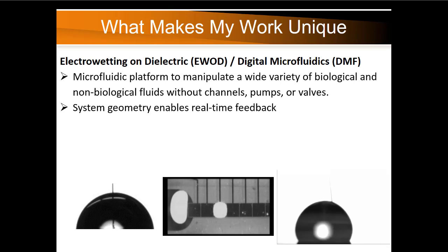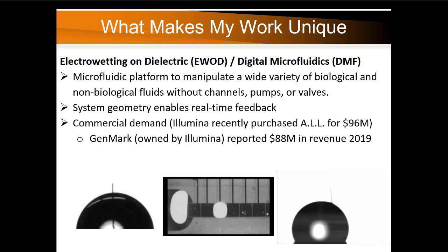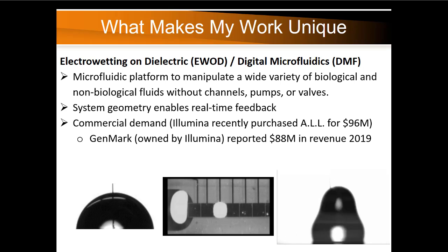Like I said, because we basically have a parallel plate capacitor for every addressable position, that enables some real-time feedback without having to look at what's going on in the device, even though in this embodiment we can see the droplets. In digital microfluidics, for a long time there was always this argument that, oh, it's kind of cool, it makes neat videos, but does anybody really care about it?